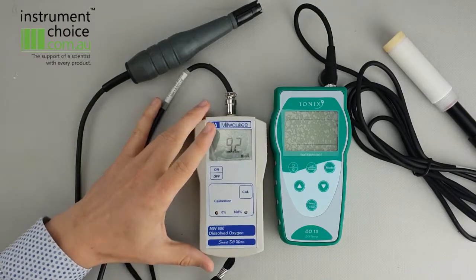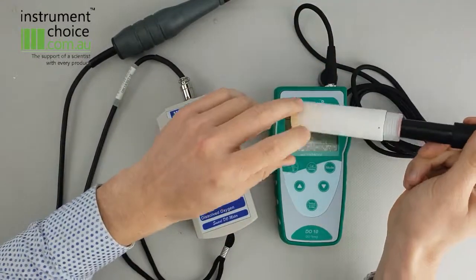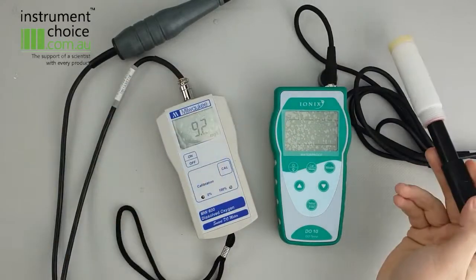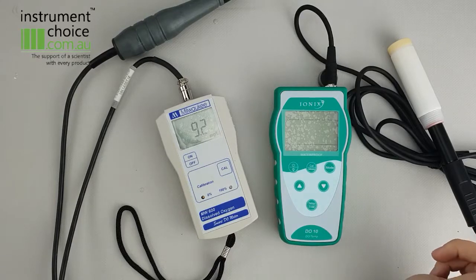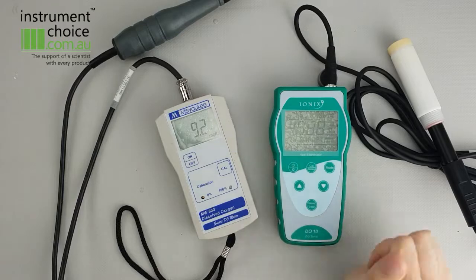Now in terms of the DO10, it's a much easier procedure. So as long as this calibration sleeve has a slight amount of moisture in it, you can do a 100% calibration. And that's all you need to do, as you don't need to do a zero oxygen calibration unless you replace the sensor cap, as it's factory calibrated to 0%.